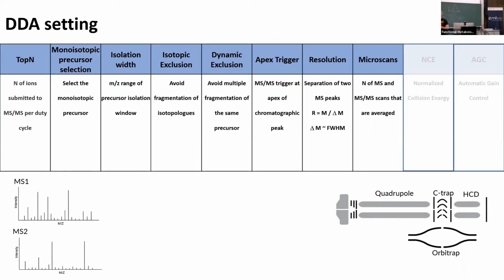If we use it for top-down proteomics, then I increase the number of microscans in order to get better signal to noise. So this is really a central setting. And obviously, if you double it, it also doubles the time it takes for one scan, so you cut your scan speed in half, or 10-fold if you increase it to 10.